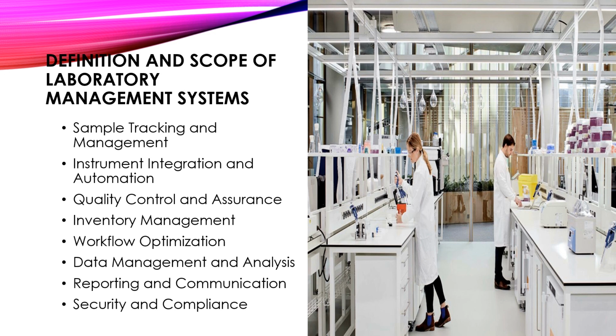Reporting and communication. Laboratory management system enables the generation of customizable reports and certificates to communicate results to clients, stakeholders, and regulatory bodies. It supports various formats and channels for results delivery, such as printed reports, electronic files, or secure online portals.